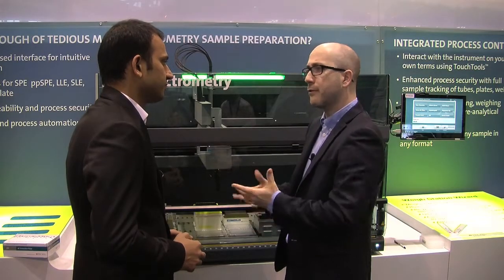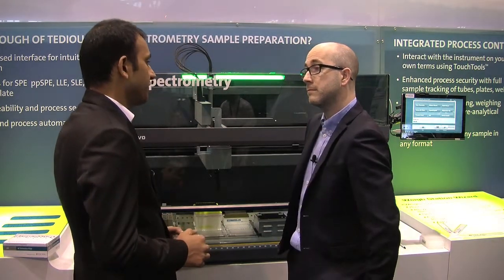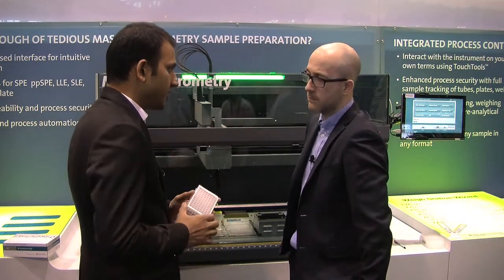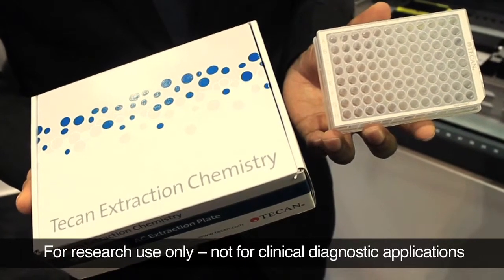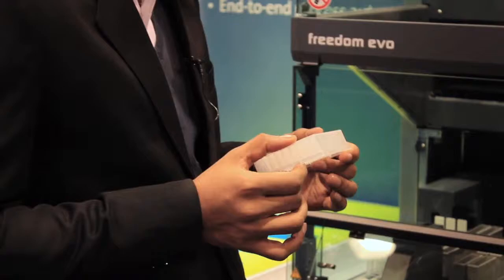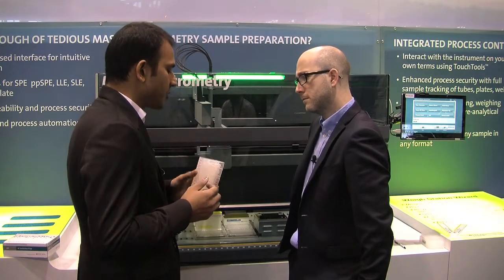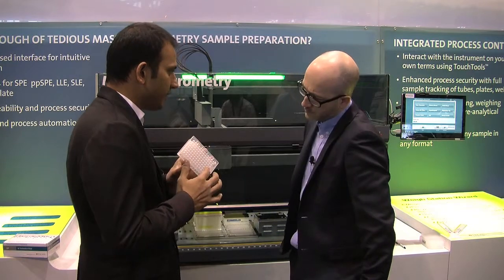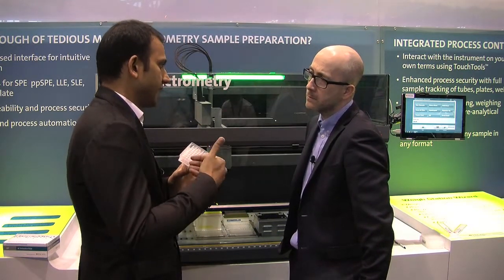Finally, are there any other products you're highlighting here at PitCon? Sure. There's an exciting new product that we've launched recently which is called the AC extraction plate. This is an extraction chemistry that allows for sample preparation for small molecules from plasma, from serum, from urine samples. It has a proprietary coating at the base of the plate which allows for absorption of molecules on that coating, thus enabling their extraction.